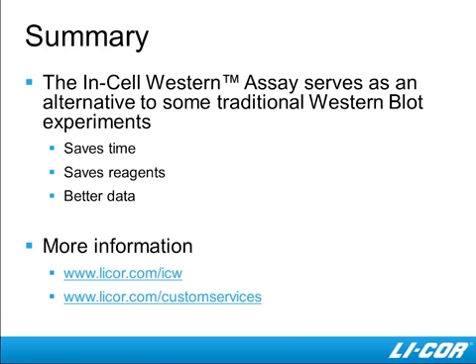Ashley, do we have time for some questions? Sure, John. I've saved just a couple of questions for the end of the webinar. The first question I have is, what if my primary antibody has nonspecific bands?